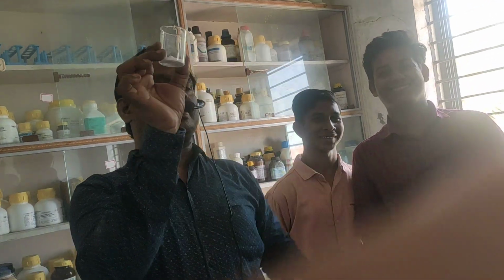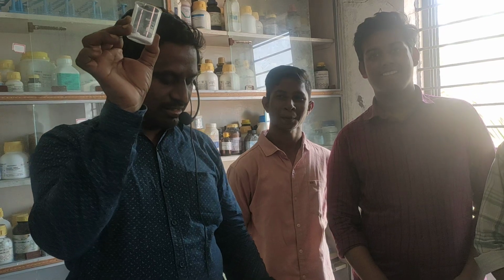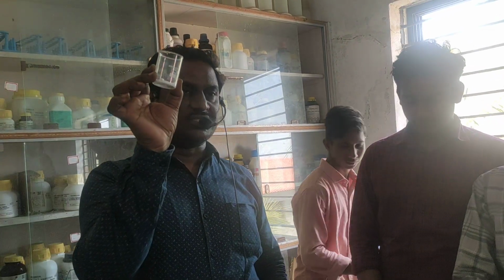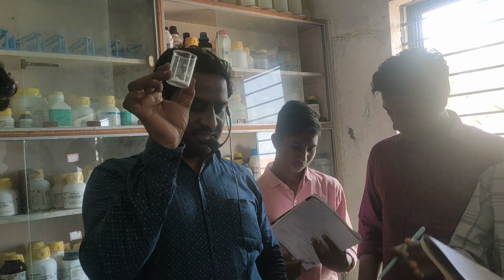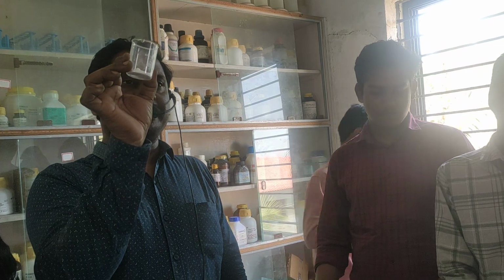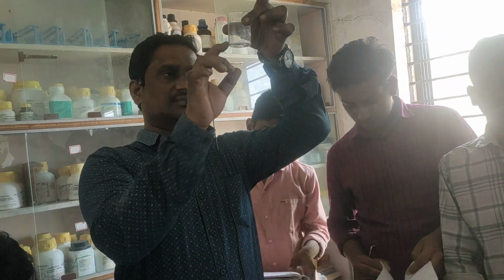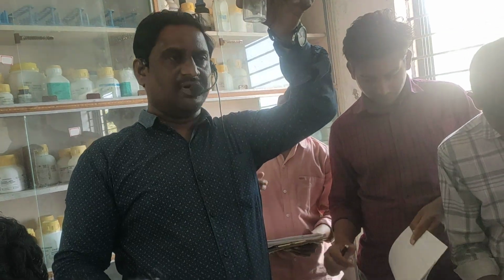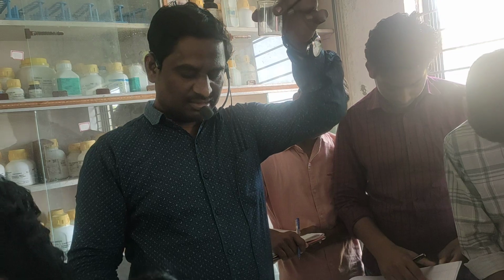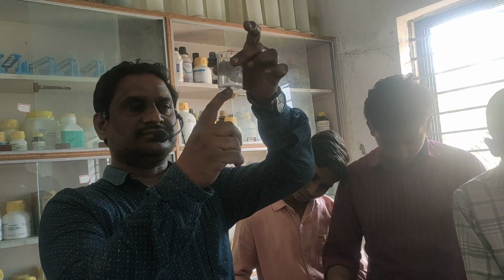So this is amorphous salt. Right, all of you keep heading: Preliminary test. First point: Appearance. What is the appearance? Amorphous. If it is amorphous, it means CO3 minus 2 may be present.